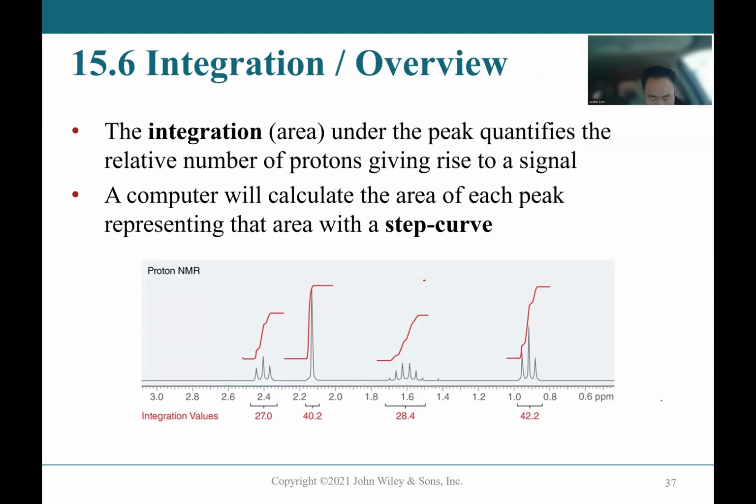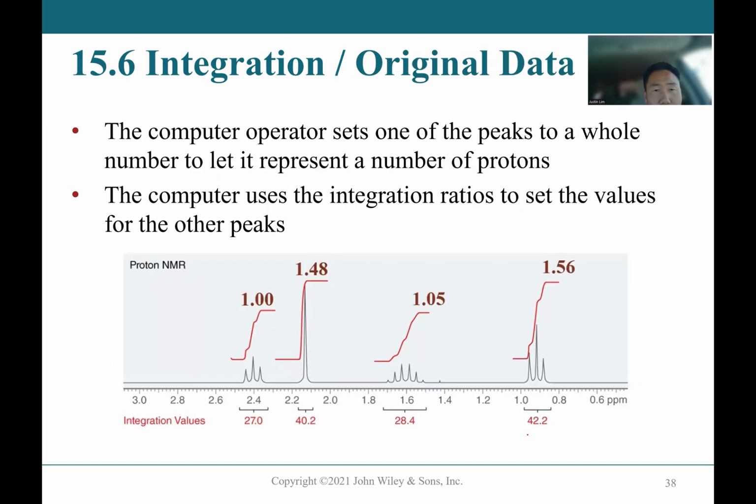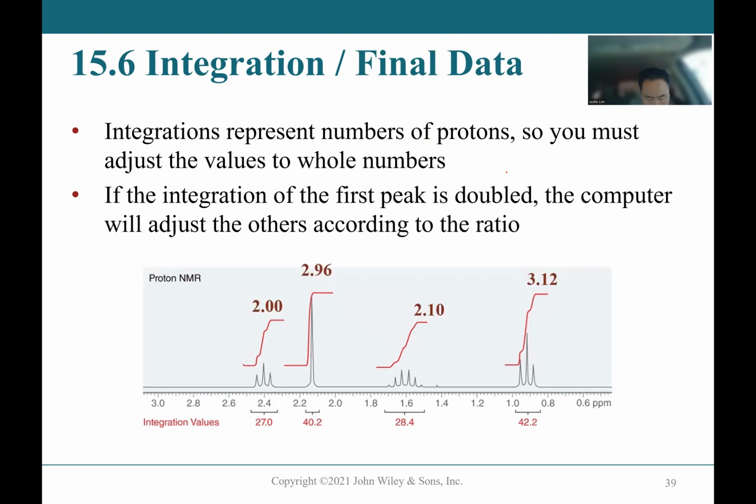So number 4, integration. Number 3, integration. Integration on the peak quantifies the relative number of protons that give rise to signals. The relative number of protons. Computer operators set one of the peaks to a whole number. Let's set this one to number 1. Let it represent the number of protons. The integration represents the number of protons.